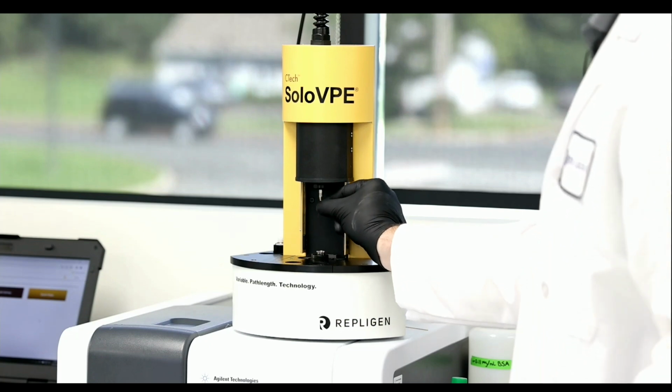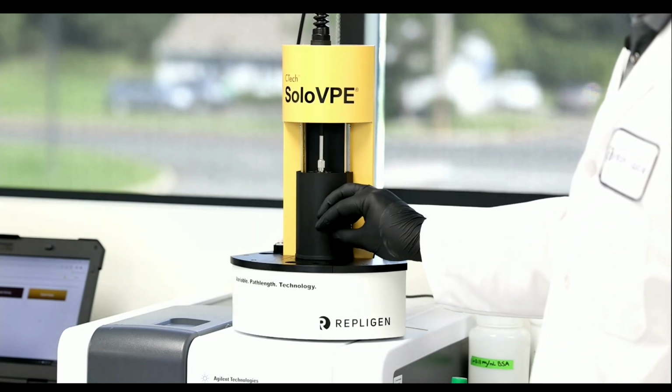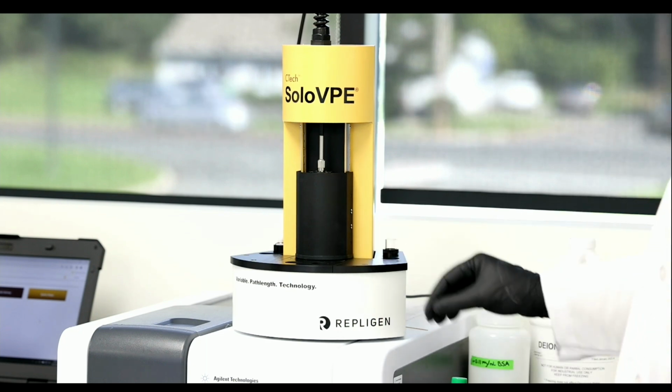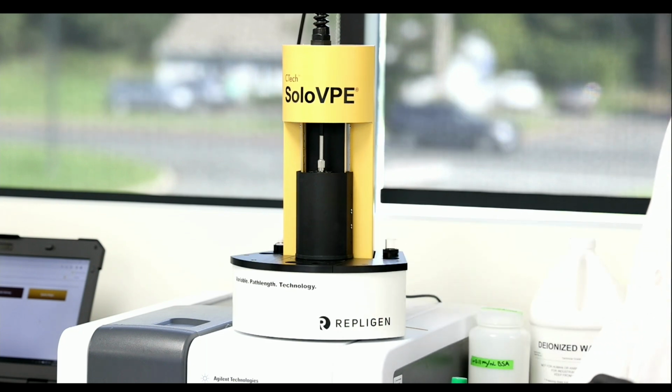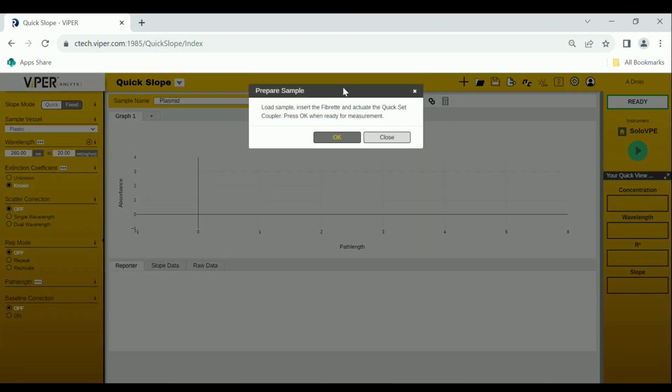We already put our fibrette in and pushed up on the silver piece. You can do that again if you think you forgot. So we're all set here. And now we can just click play on our method. So I'm just going to hit the play button to run the method.